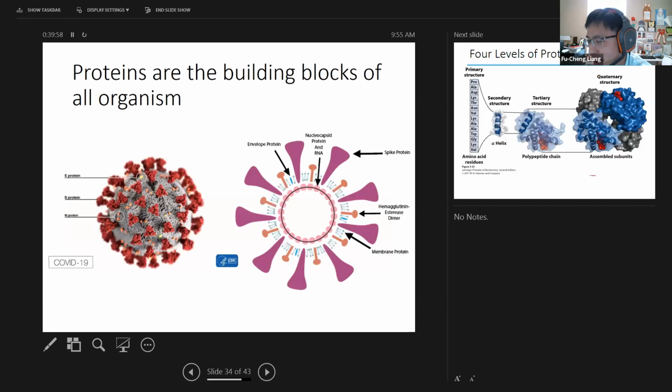So the reason why I talk about this is, as you know, what is the most famous topic nowadays? COVID-19, everywhere, every day, all right? So scientists have now spent a lot of money and a lot of time wanting to develop a vaccine or a drug to kill this virus. But how are they going to do it? As we already know, and anisotropy we are talking about, they can use that to detect the binding between the virus and some ligand.